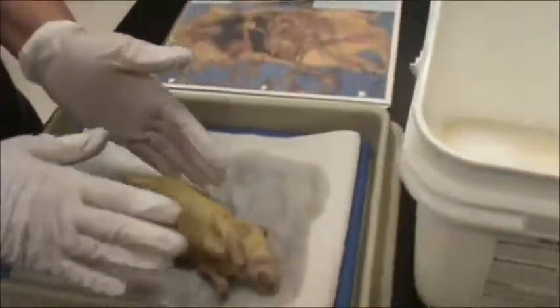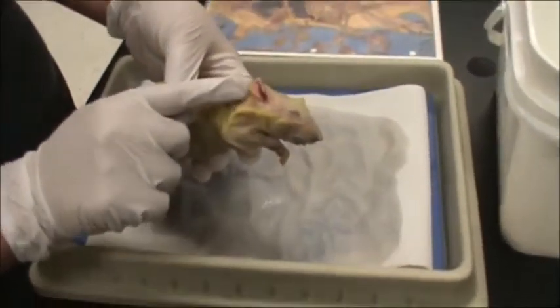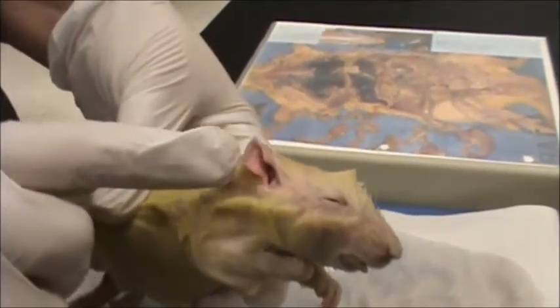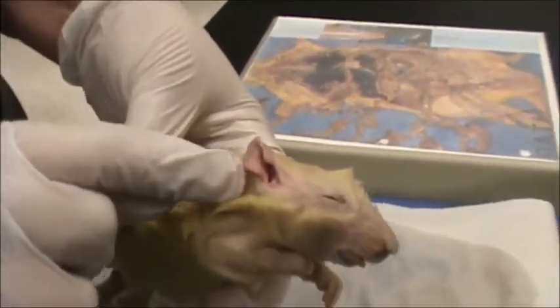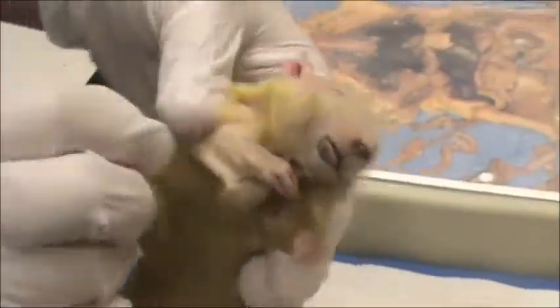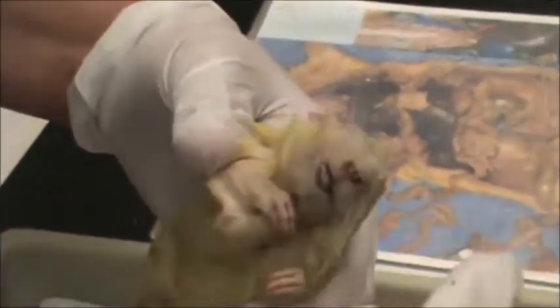We're going to talk about first his external parts. If you look here, this is the ear flap, which we call the pinna. We have a pinna also — you put an earring in it, sometimes you put your plugs in it. But this is the pinna of the rat. Right here is the eye. Right over here are the whiskers, and we give it a fancy name called the vibrissae. Here is the external nares, which is the nose — the openings to the nose.